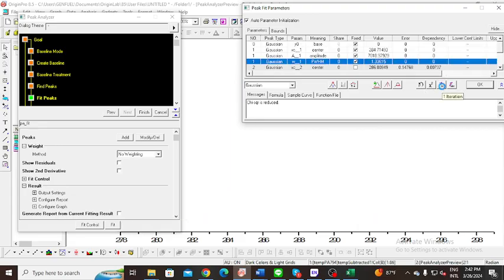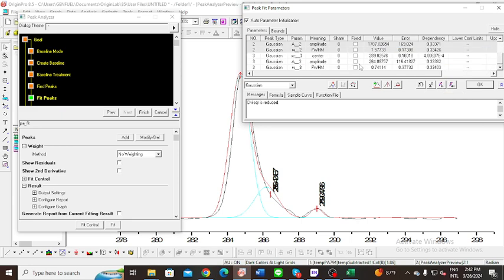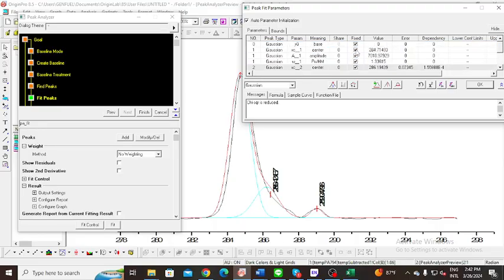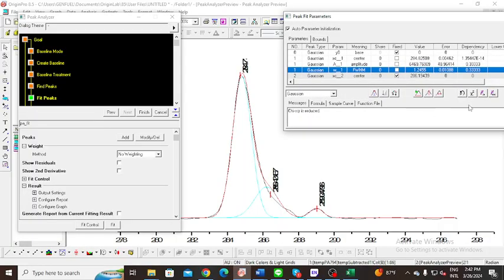So for example, we just choose this one. Maybe it's already okay. And if, for example, the number 2 is already okay, and you want to change the first peak again, you need to click again, re-click and do again, and uncheck the other. And you can see the first peak will be moved like this or like this. So it depends on what we want. Maybe like this or like this. I think it's better.